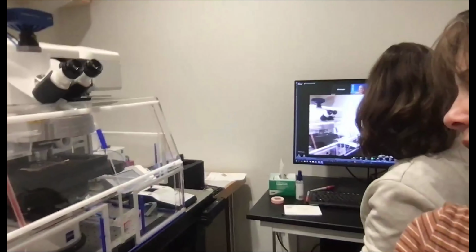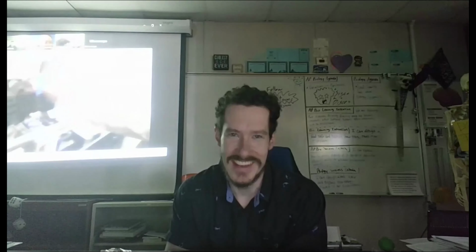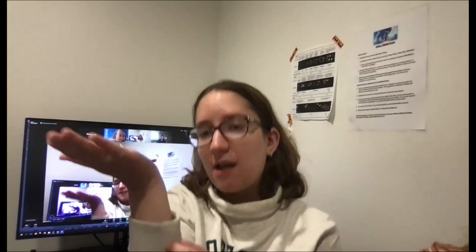Would it be okay, really quickly, if we look at the sample that's mounted on the microscope? Yeah, I think it's really hard to see. Can you see that glass rectangle there? Yes, we can. So that is a microscope slide, and the samples are actually sitting on top of that glass slide, and they're sandwiched between another piece of glass.